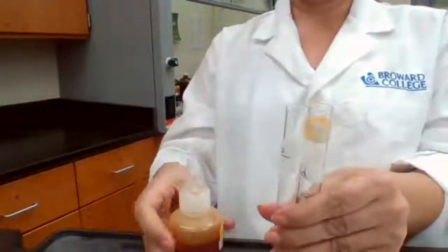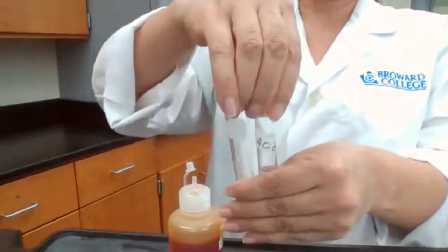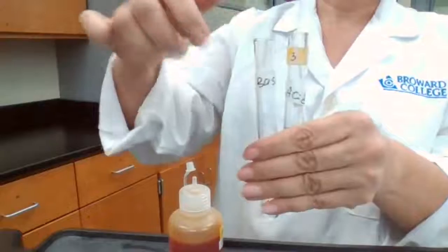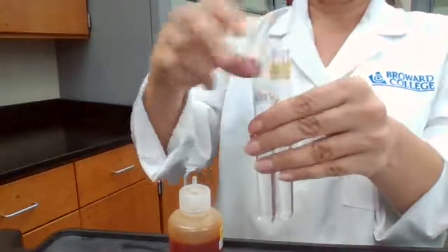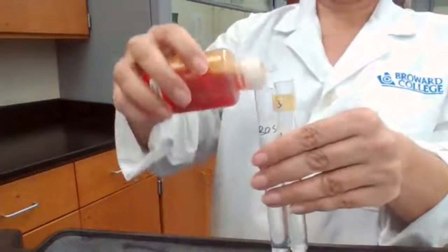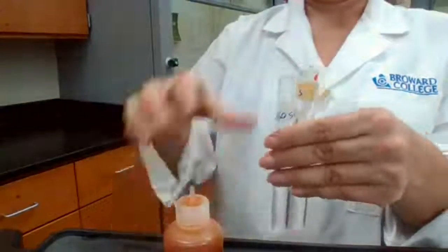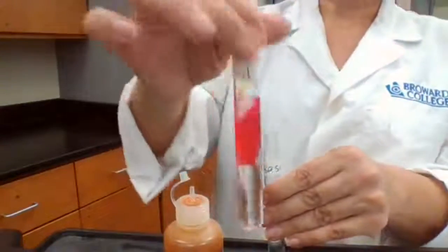We want to know what happens to the color of methyl orange in acid and in base. When we add it to the acid, the color is red.